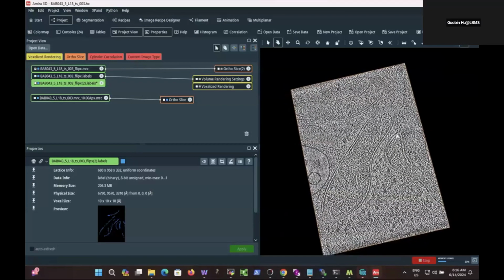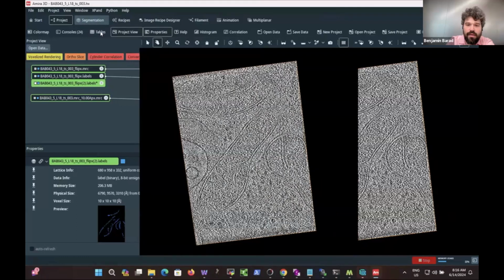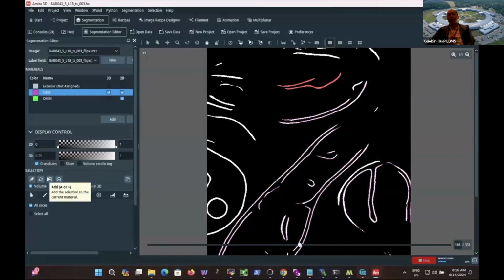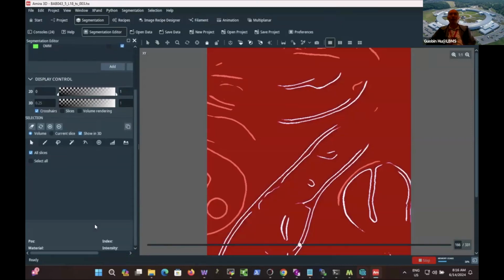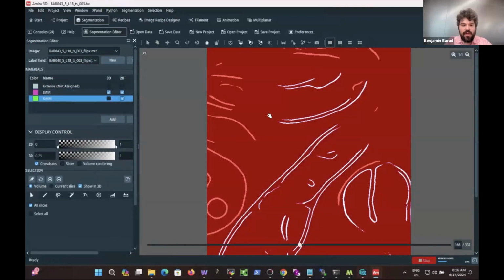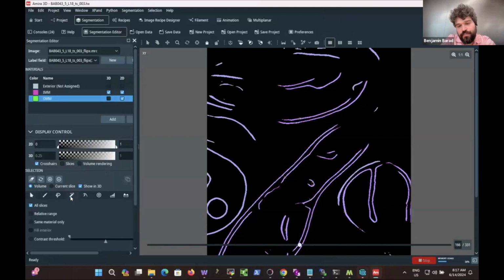Excuse me, another question. Hit me. Yeah, so this type of work, including cryo-FIB sample prep, image processing, then segmentation. Which part do you think is most time consuming? Segmentation. Segmentation, really? It's changing, but yeah, it's a very slow process for sure.